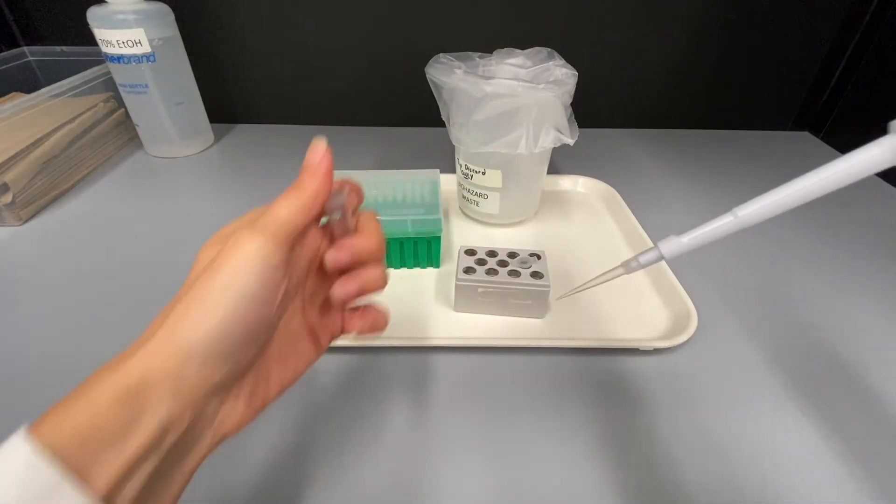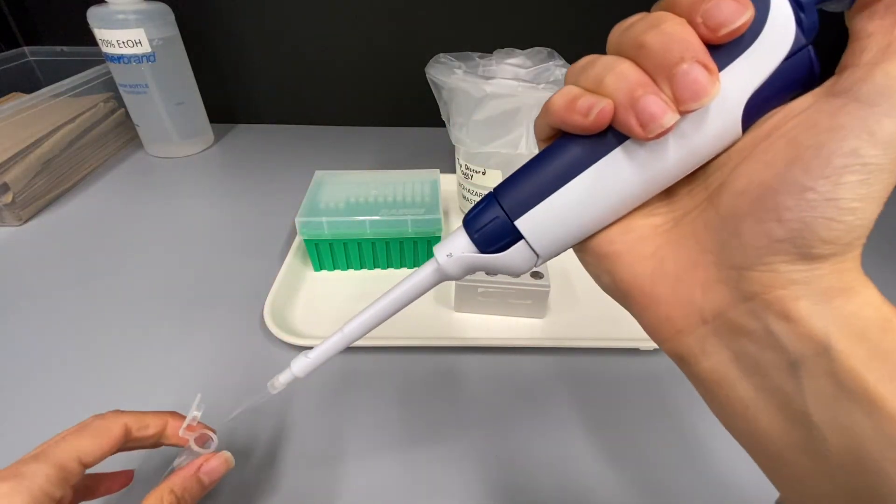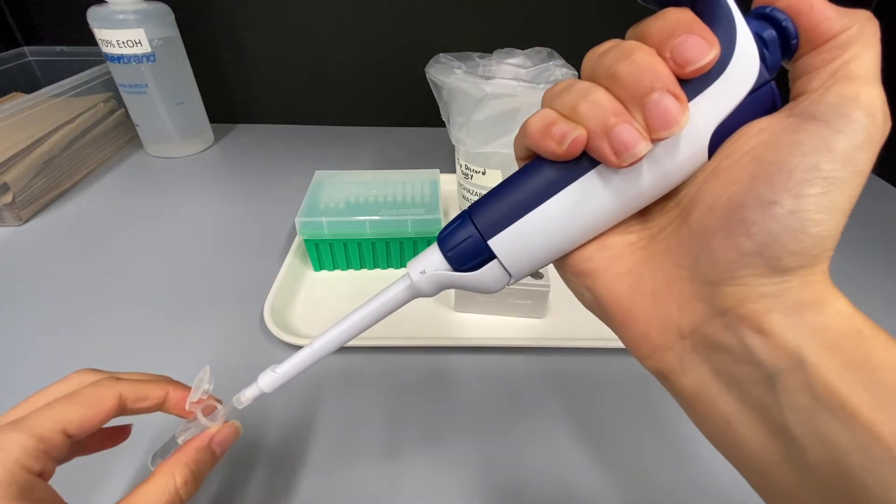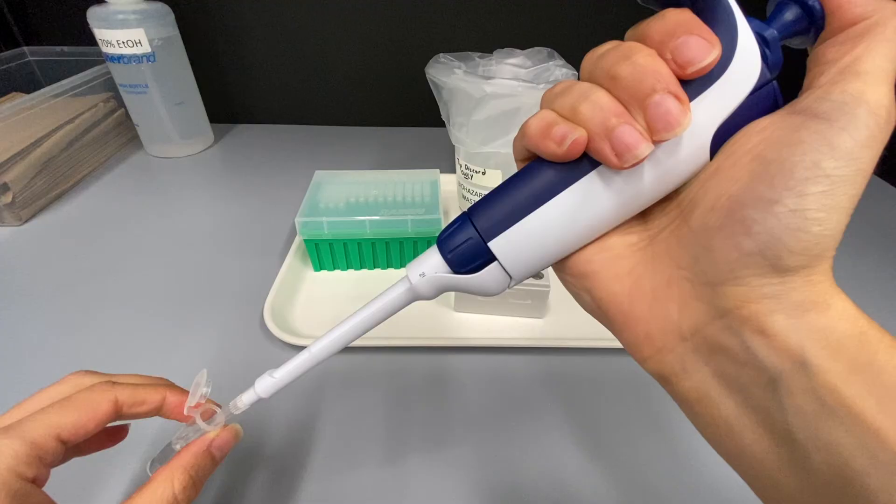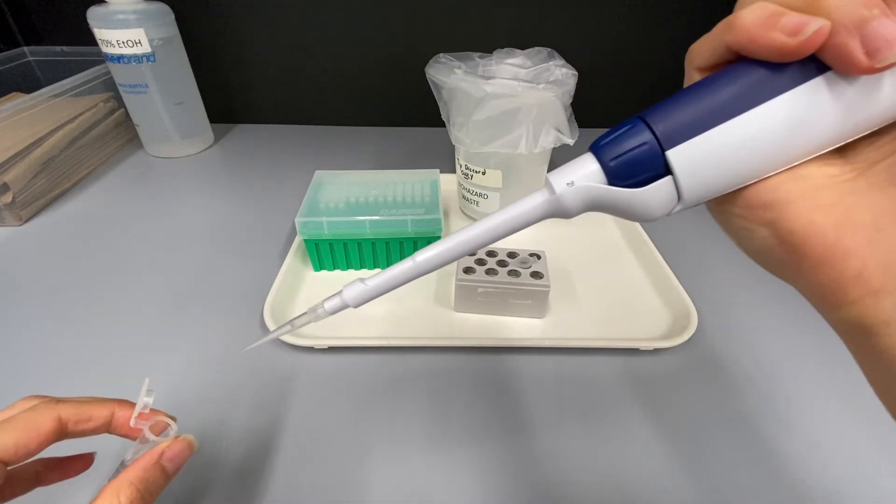Open the tube, push the pipette plunger down to the first stop, put the tip into the solution, and slowly release the plunger to pick up the liquid, keeping the tip in the solution until the liquid has fully entered the tip. You should not see any bubbles in the liquid in your tip.